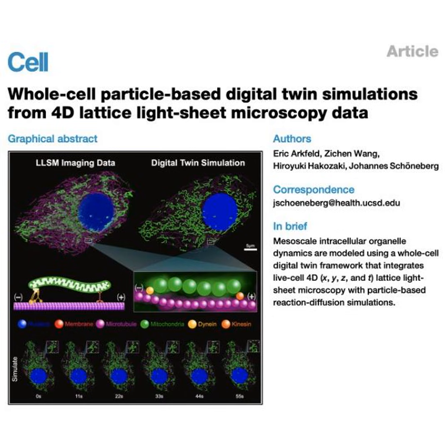Here's where it gets really interesting. They moved away from the nocodazole-treated cells and looked at untreated, perfectly healthy Cal-27 cells. The magenta microtubule tracks are completely intact. But immediately, they hit a massive technical hurdle. A microtubule is incredibly thin, only about 25 nanometers wide. It's so small that it is literally below the diffraction limit of the lattice light sheet microscope. Meaning the microscope is incredible, but physics won't allow light to resolve a structure that tiny?